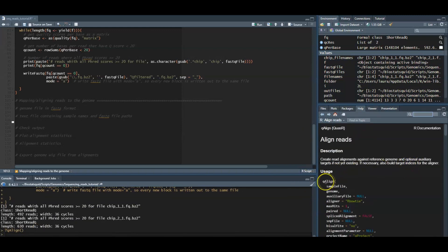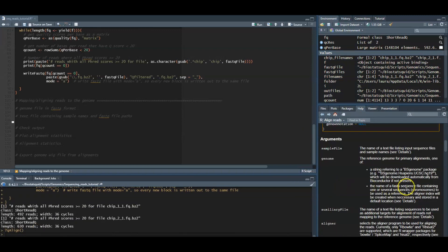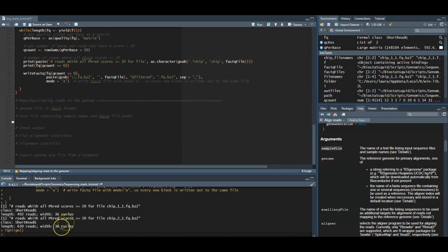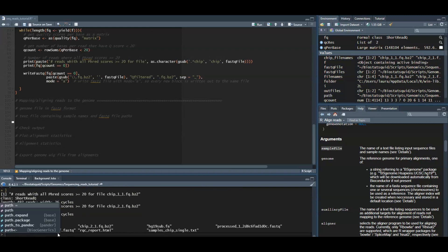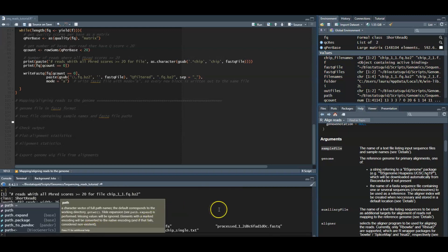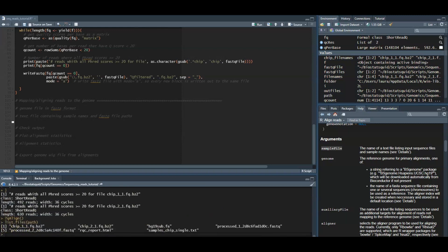First, a genome file in either FASTA format or as a BSgenome package. And second, a sample file, which is a text file and contains file paths to FASTQ files and sample names. So I will just show you how the sample file looks like.